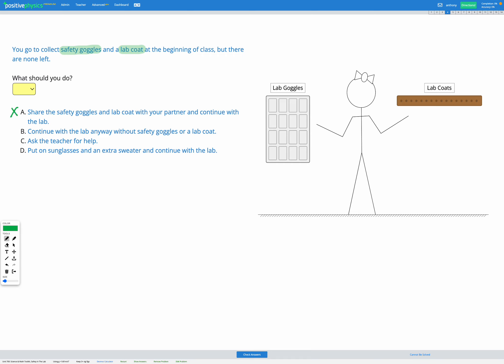What about B? B is continue with the lab anyway without safety goggles or a lab coat. That's also not going to work because we need a lab coat and safety goggles to keep our eyes and clothes and body safe during an experiment. So B is not going to work.